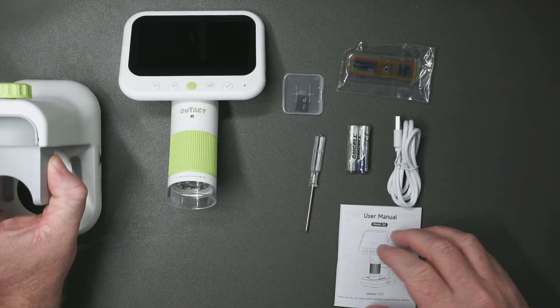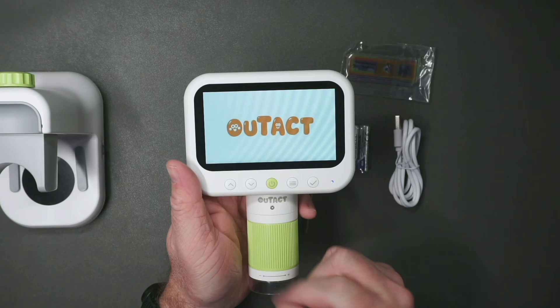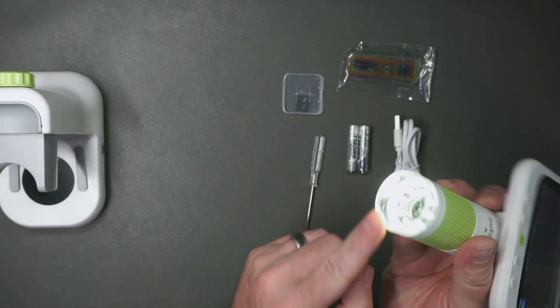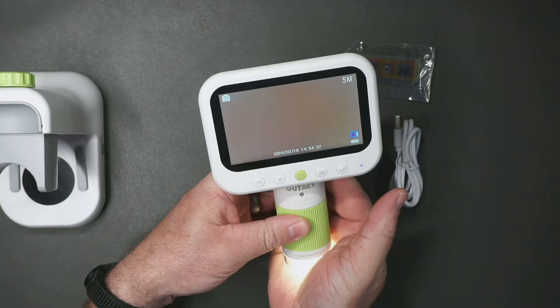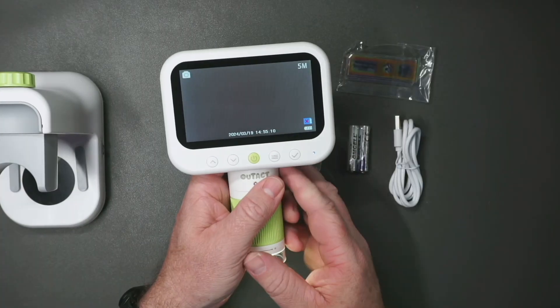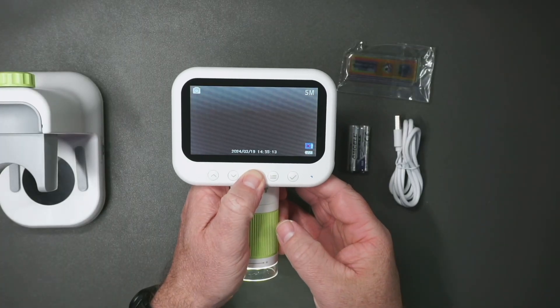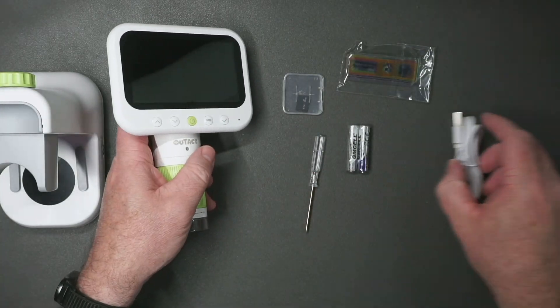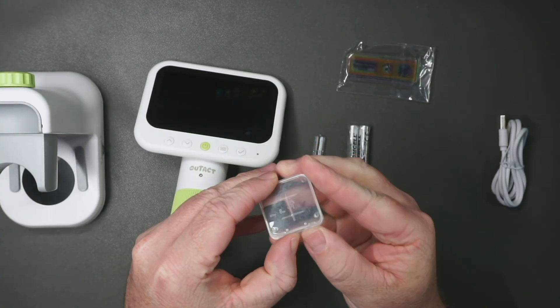This is everything that comes with the microscope. You've got your main microscope here — press and hold to turn it on, and it has some LEDs to light up whatever you want to have a look at. You can adjust the focusing here. That zooms in quite a bit. It also comes with an eight gig TF card if you want to record things directly.